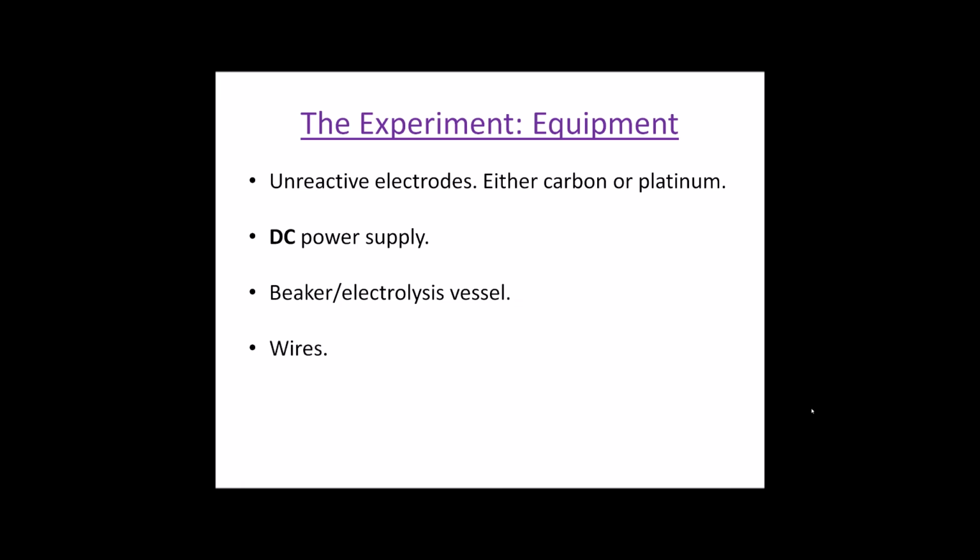You're going to need wires, obviously, to connect up the power supply with your electrodes. And then you're going to need your aqueous electrolyte solution to perform your electrolysis on. That's the basics of the equipment. We'll talk about some more later.